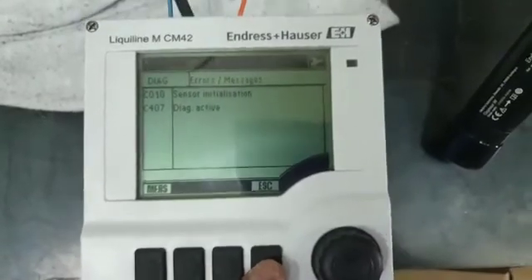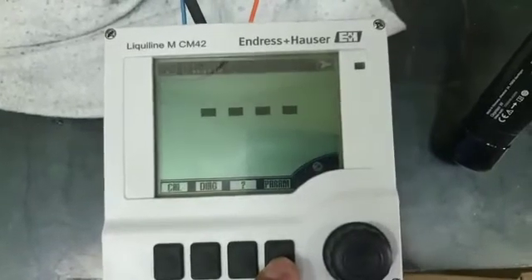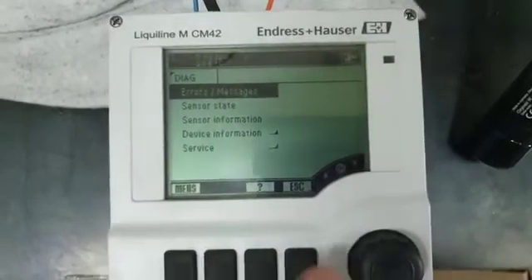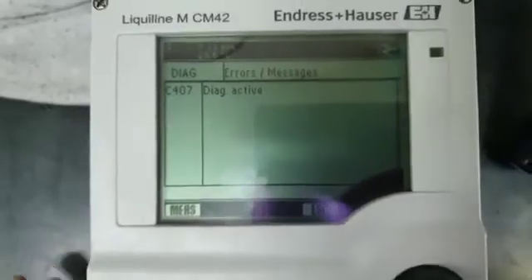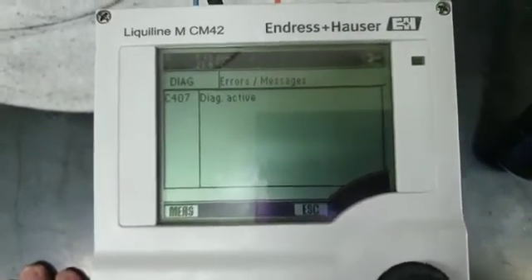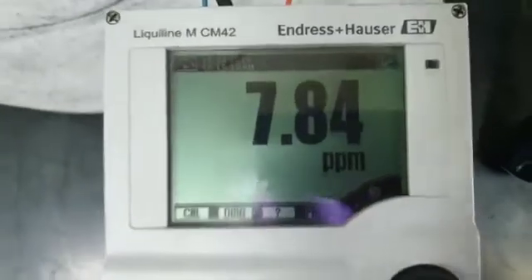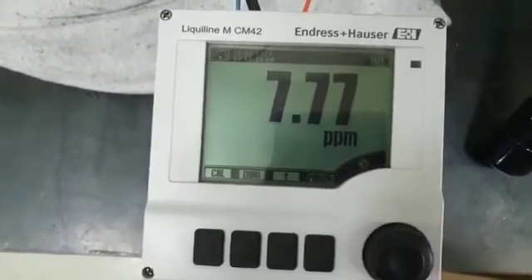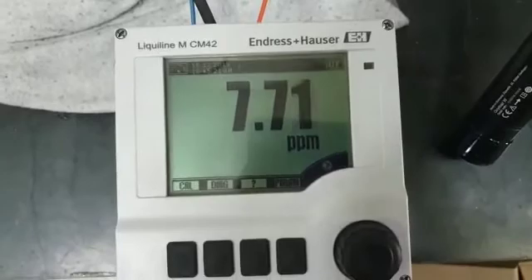Now I connect it with another sensor which is working. Escape it, and diagnose — if you notice, there's no red alarm. The diagnostic is active and the reading came back. I go to measure and the reading came back. So this confirms that the one reportedly not working is confirmed dead, confirmed defective or failure.